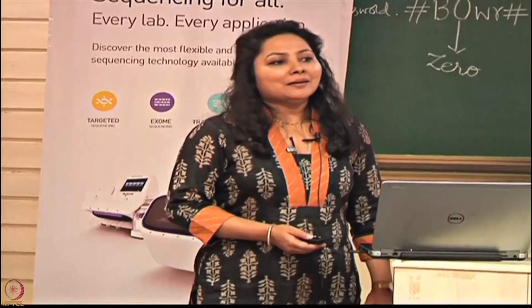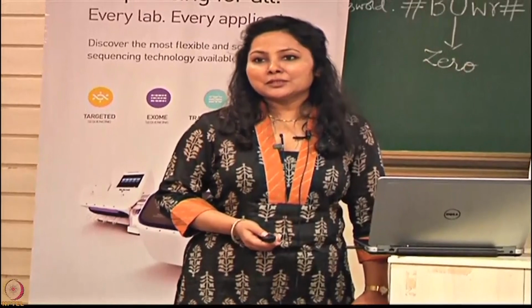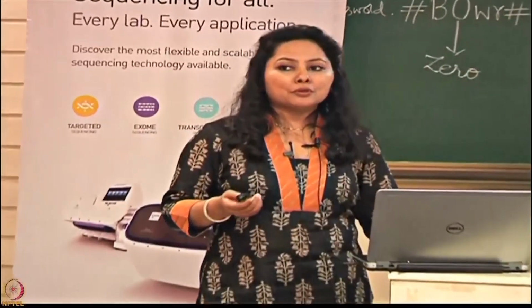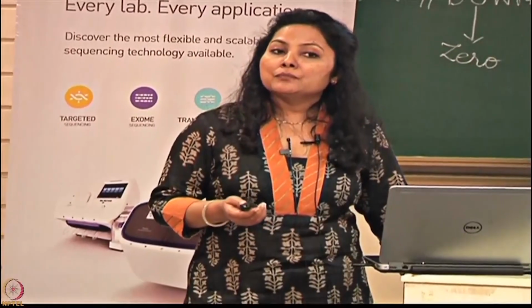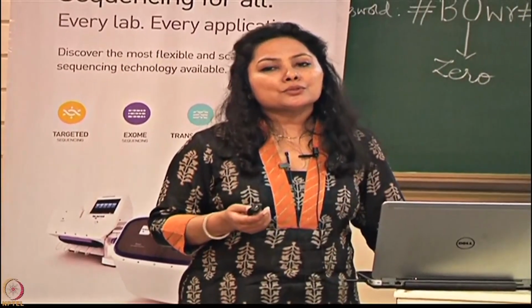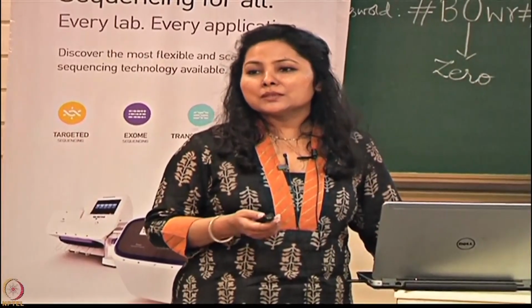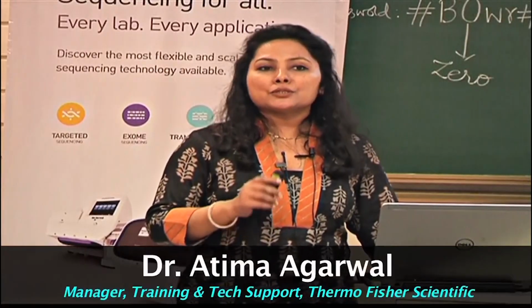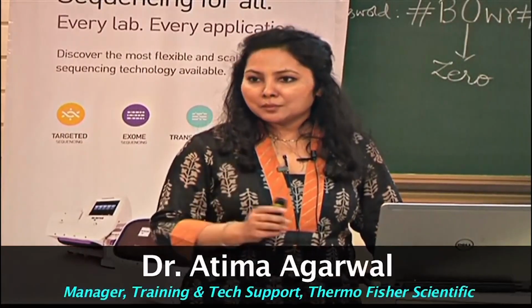So, I am Atima Agarwal from Thermo Fisher. I have been with this company for many years now. So, if you remember or if you have heard, in the pre-1990 era, sequencing used to be done on gels with radioactive labels. And it used to be a very, very cumbersome affair.